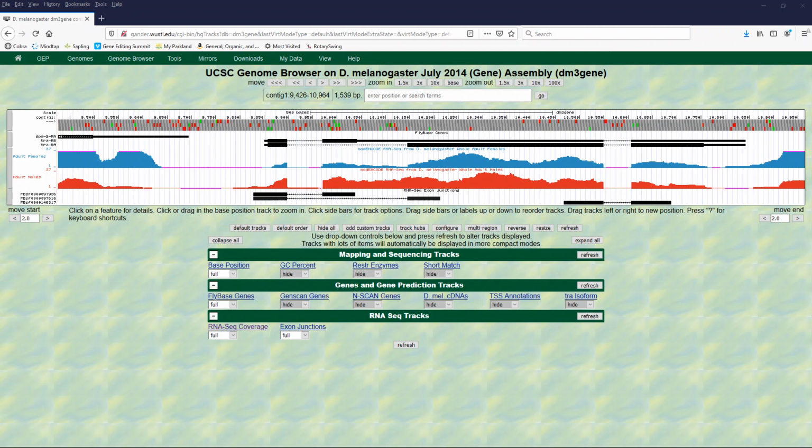And now we can finally answer the ultimate question. So first of all, males use one of these isoforms and females use the other one. So again, zooming out here, we see that the 5' splice sites are the same for both isoforms. However, the 3' splice site is different for transformer A. Sorry, this is B, transformer B, compared to transformer A. The 3' splice sites are different.